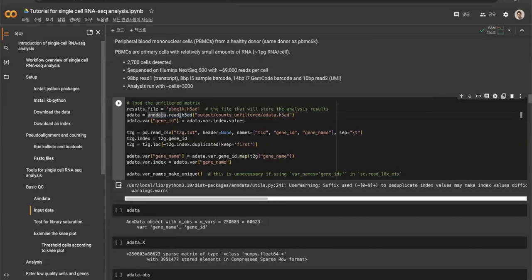So once you read this file, it is stored as an AnnData object, right? In an AnnData object, you have the var object. Then within this var, you can store the gene ID from the index of the values, right? Then once you've done that, you read the table file using the pandas read_csv, right? So this is two different things. anndata is the library for single cell data sets, you read the H5 file, but pd is pandas, which is reading the text file.